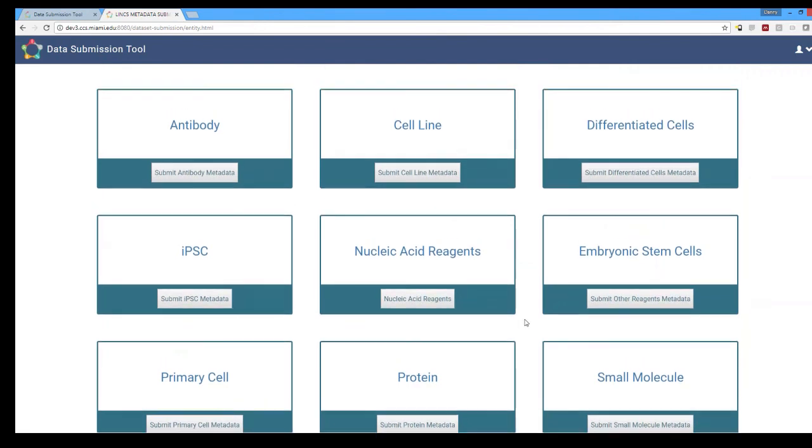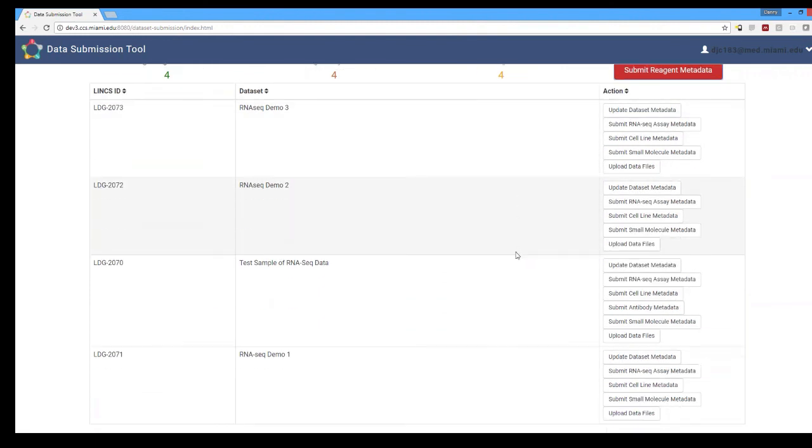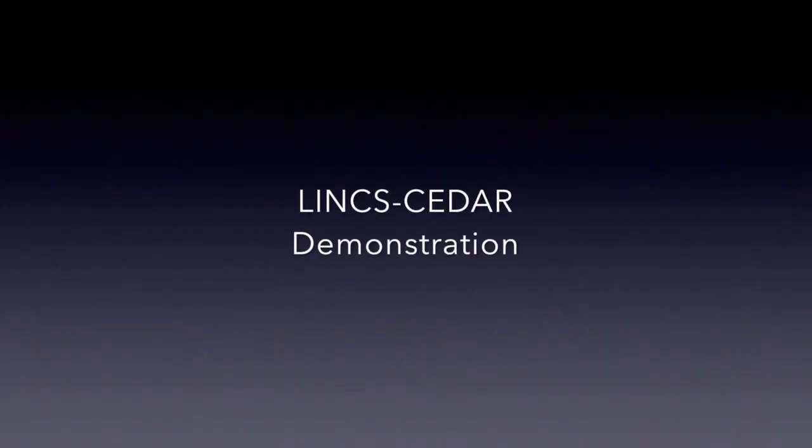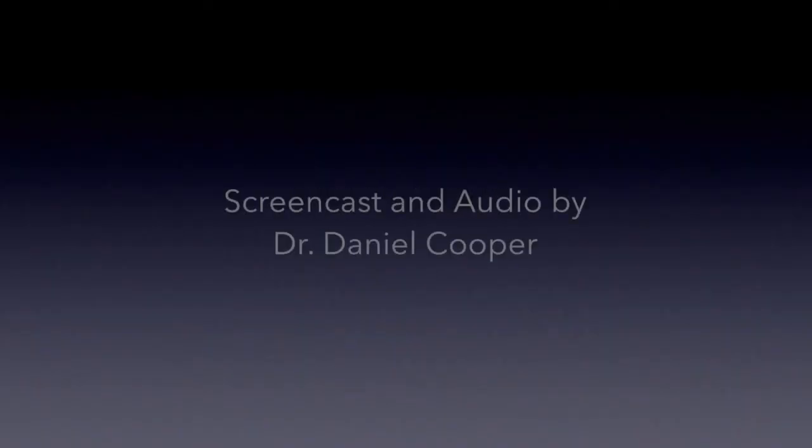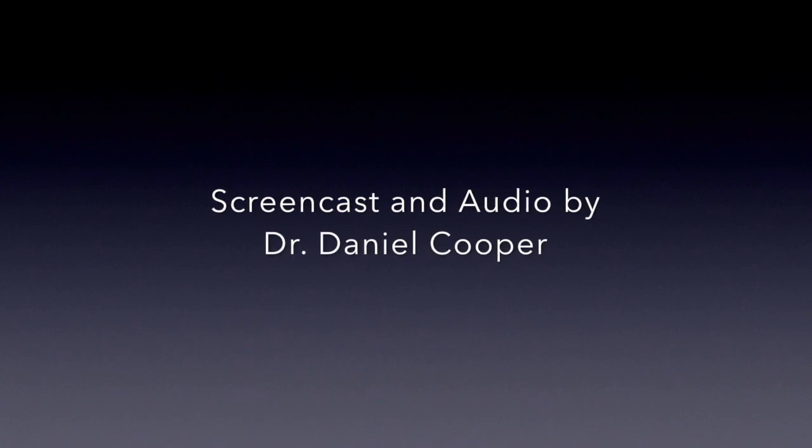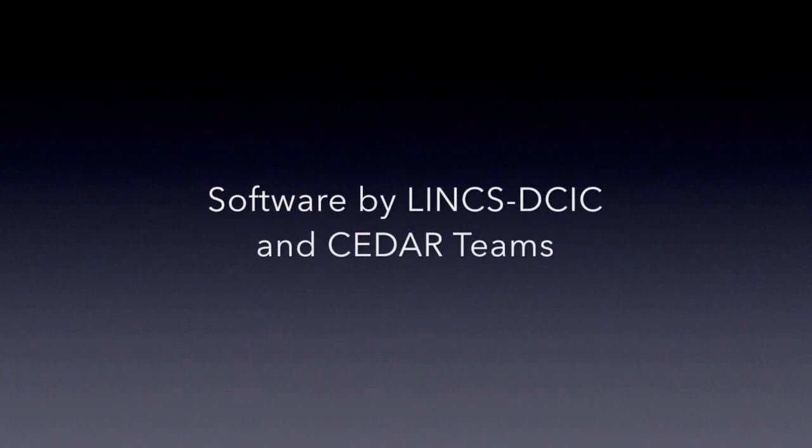So this represents what used to be our metadata submission tool that has now been reutilized for the reagent metadata but with that thank you so very much for watching this little demo of the LINX CEDAR DCIC data submission tool. I hope that you enjoyed it and thank you again.